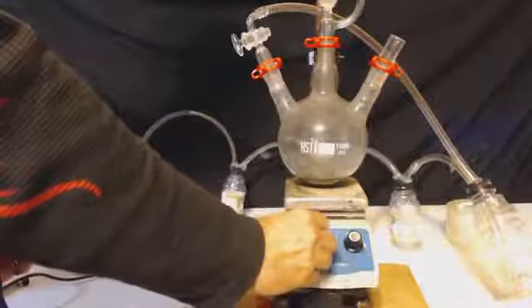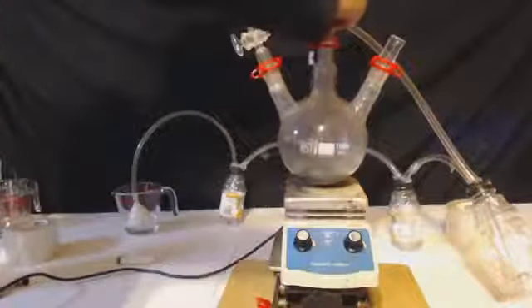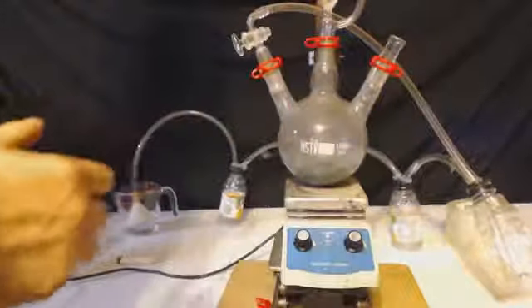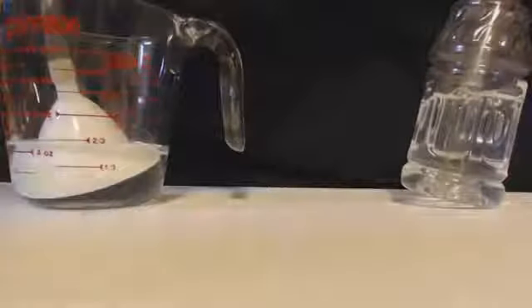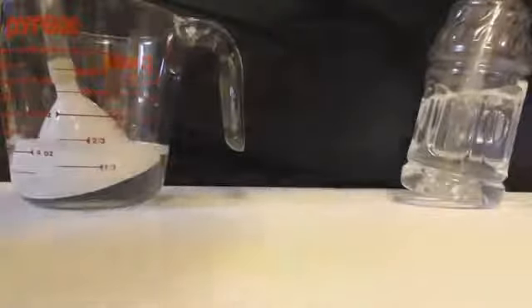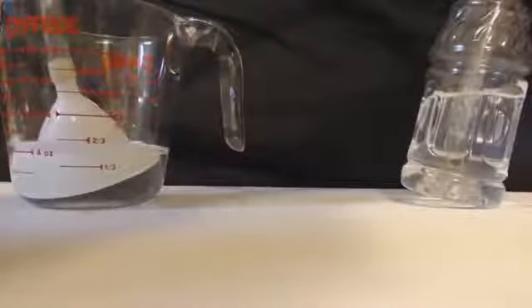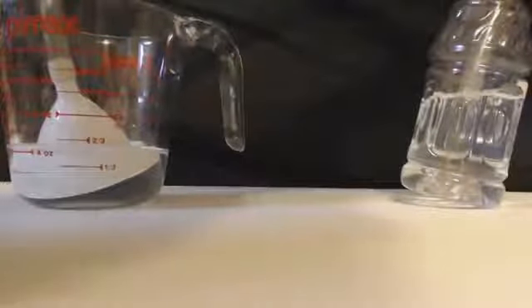So now I'm real paranoid about turning it up, so I'm dripping it in real slow. I do have some liquid in there now, so I can start to stir it a little bit. And you'll see now, see how I've got the bubbler going. If you look at where the funnel's at, you can't see the bubbles come in because they're behind the funnel. But when it bubbles on the right in that bottle, if you look at the funnel on the left, the water flows all around the place because it's just going from one bottle to the next until it gets to that funnel. And by then it's just hydrogen and air.